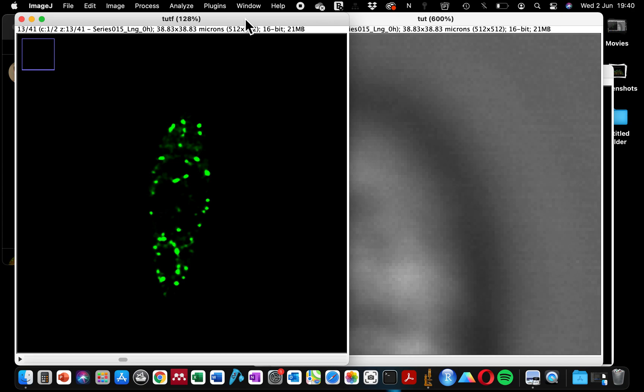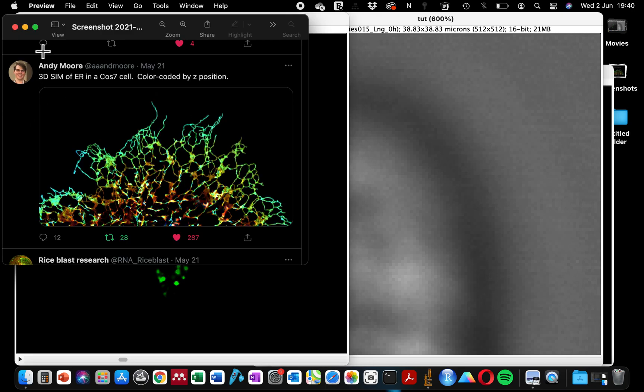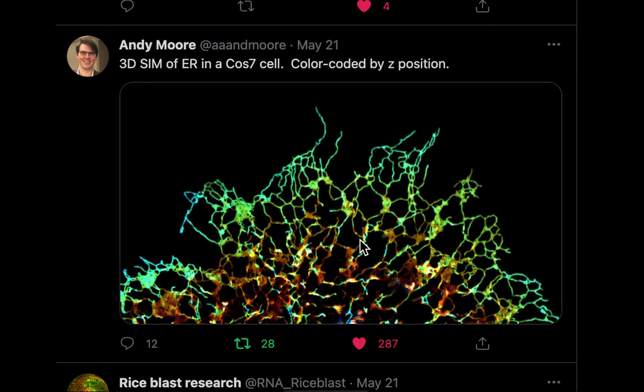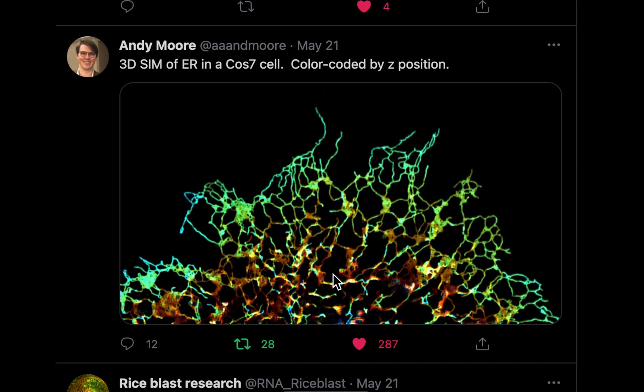Today's tutorial was inspired by a tweet from Andy. He shared this beautiful microscope image on Twitter and you can see this elegant microscope image has more information to tell you.